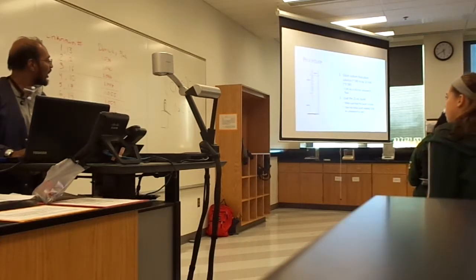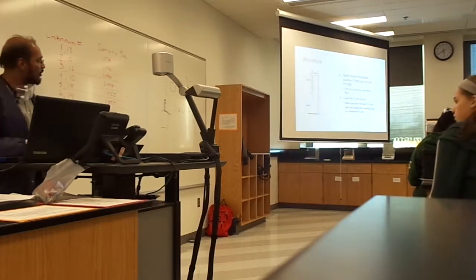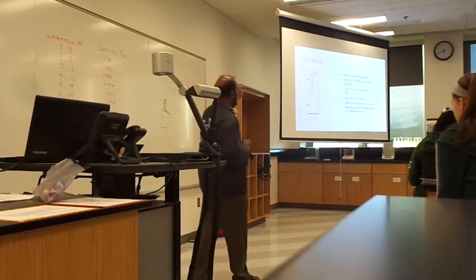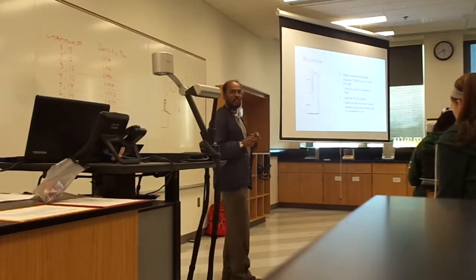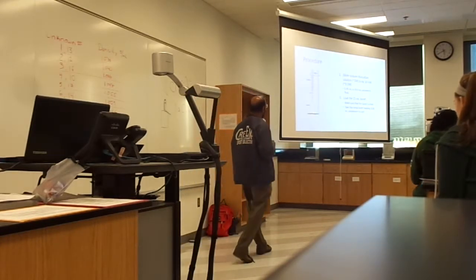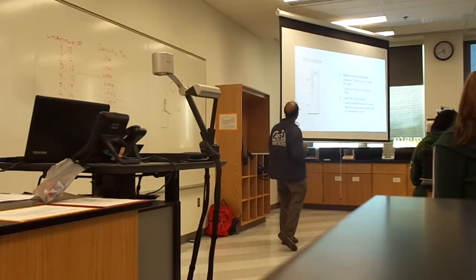Initially you will have a burette ready with sodium thiosulfate, roughly around 0.1 molar. Make sure that you use the diluted sample, not the original thiosulfate solution that you get from the tank. And then you load that and have it at 0.